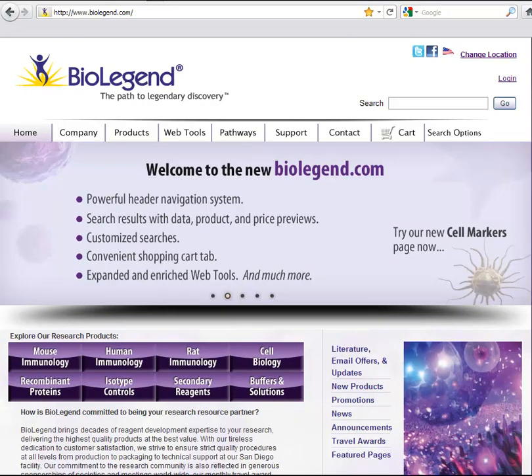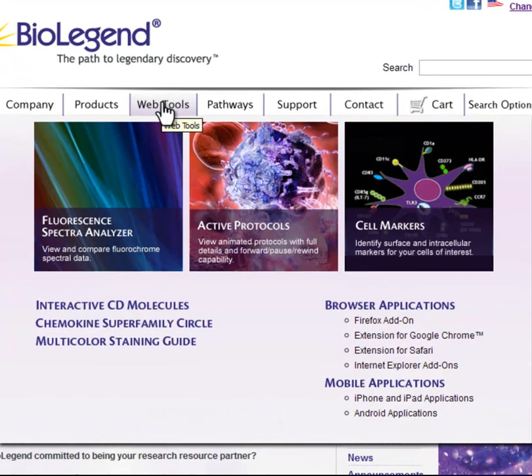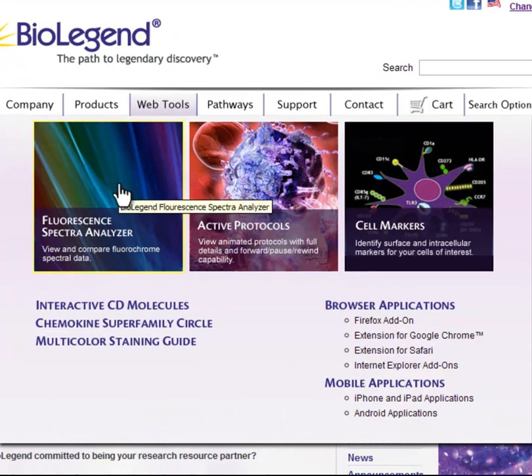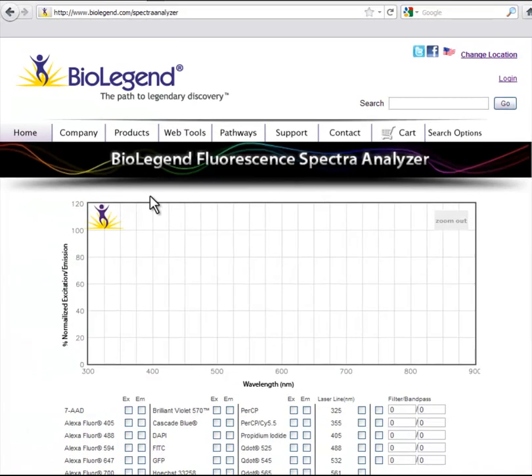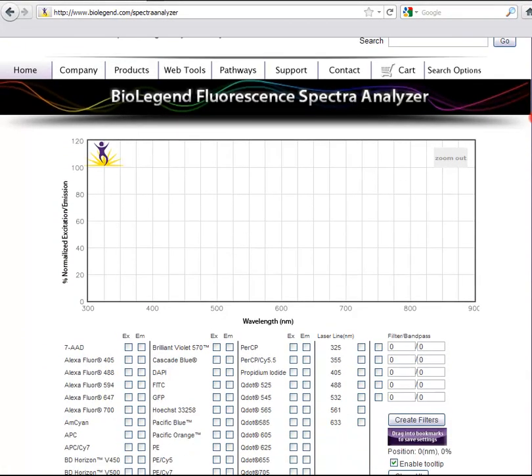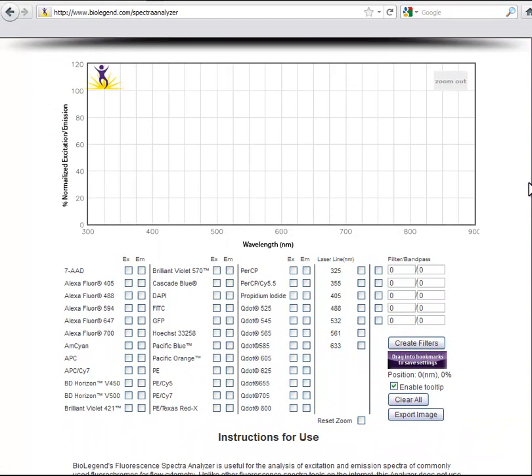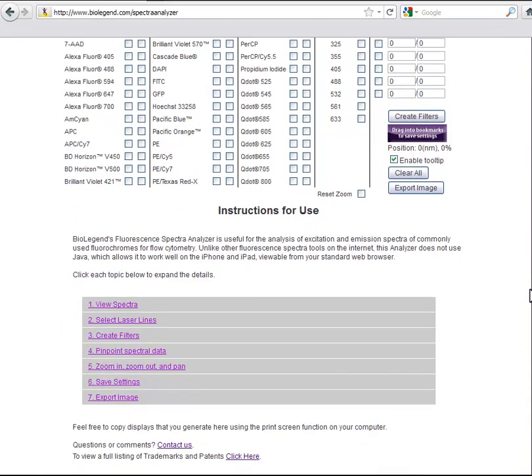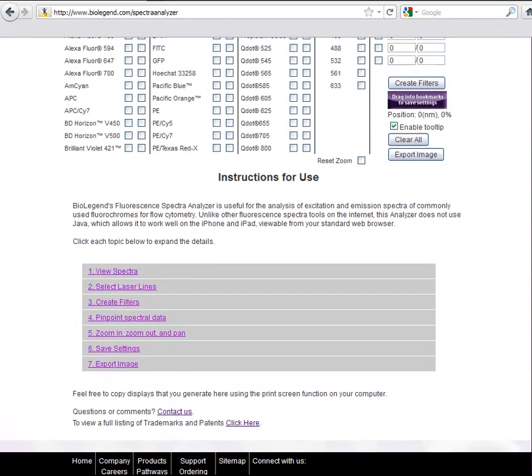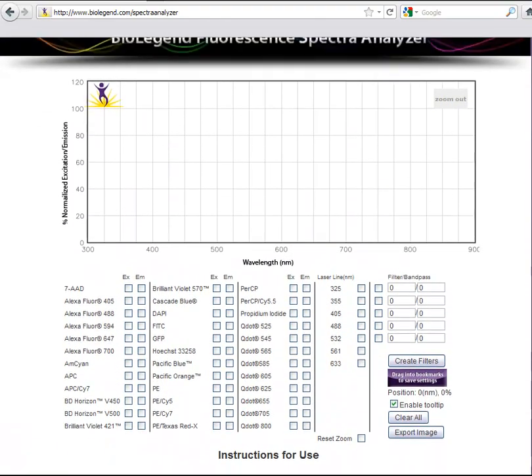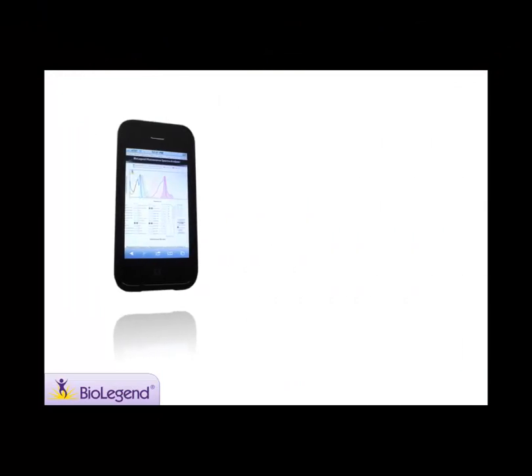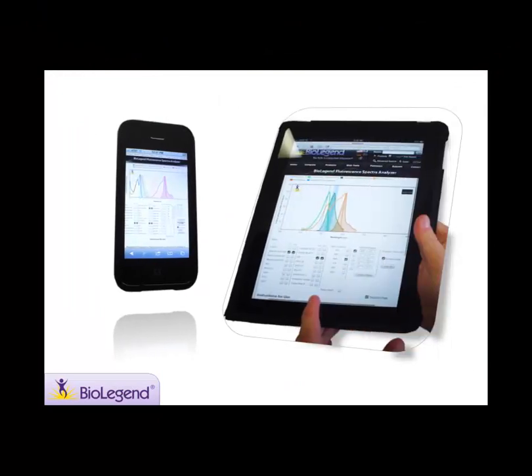Welcome to BioLegend's Fluorescent Spectra Analyzer. This application is useful for comparing emission and excitation spectra of commonly available fluorophores for flow cytometry. Unlike other fluorescent spectra tools on the internet, you can go mobile and use this web tool on any browser-capable mobile device such as an iPhone or iPad.